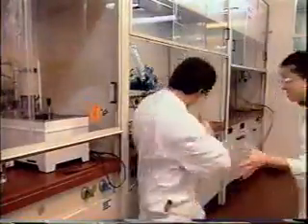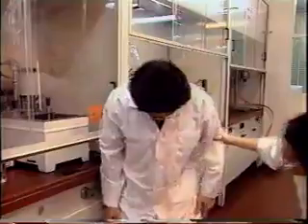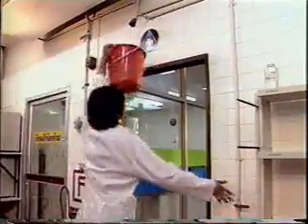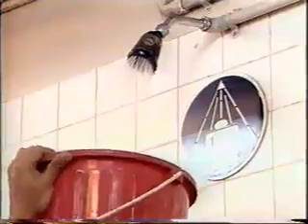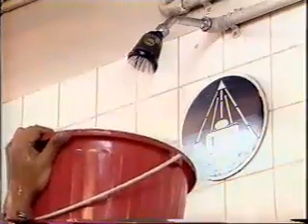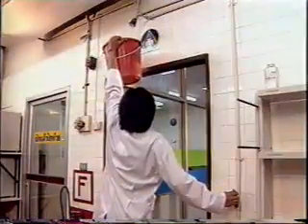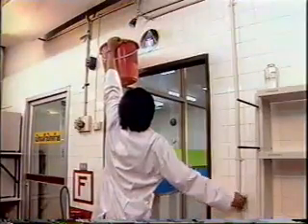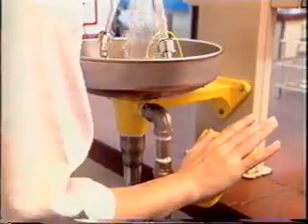If chemicals spill over your clothes, remove the contaminated clothes immediately and use the nearest emergency shower. Wash the chemicals off carefully. To ensure that the water in the emergency shower and the eye wash fountain is always clean, the shower and fountain have to be opened at regular intervals to remove the old water from the system. Otherwise, bacteria may grow in the pipes and cause damage to the injured.